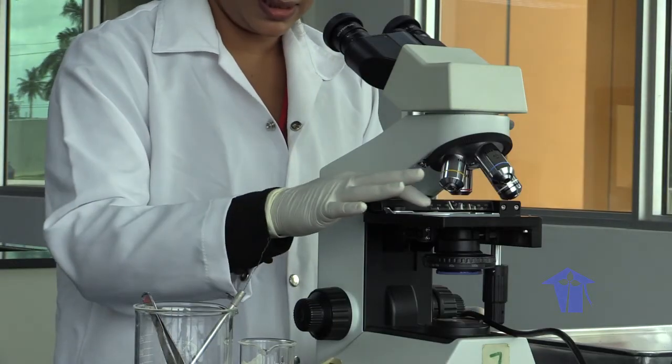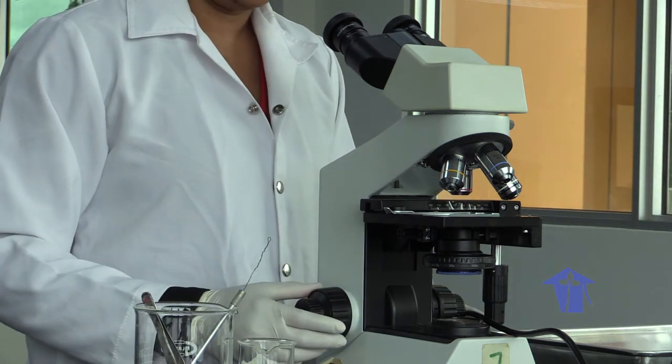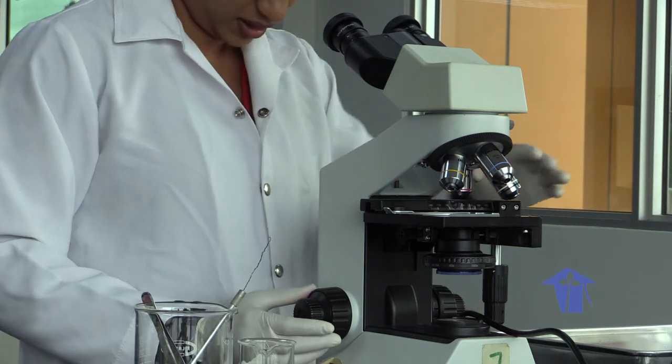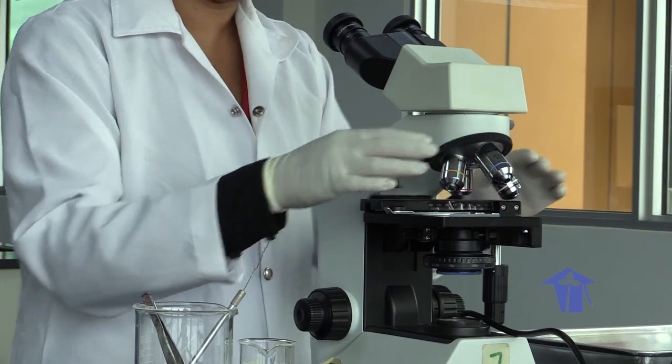So we have placed our slide under our microscope. As with any specimen, when you're looking at a microscope, the first thing you have to look at it under is your 4 times magnification. So we have shifted our objective lens to the 4 times magnification.